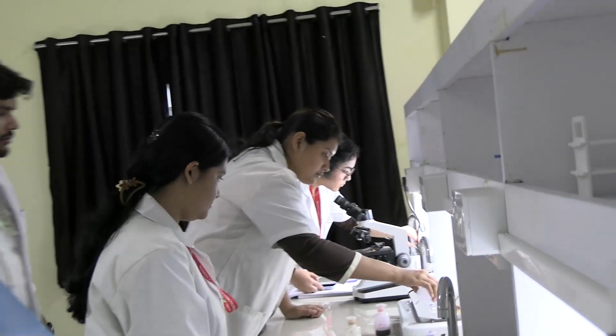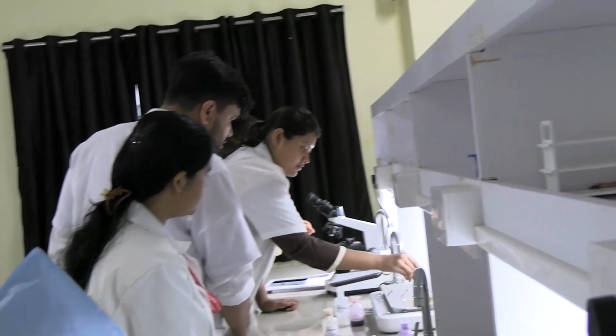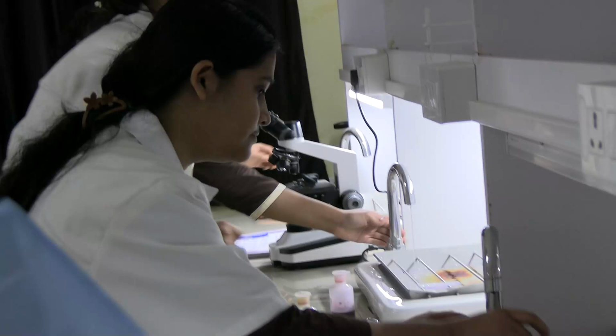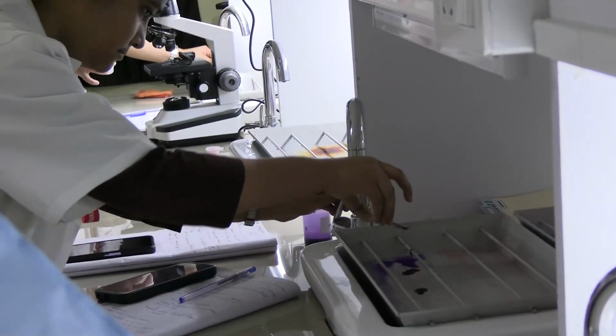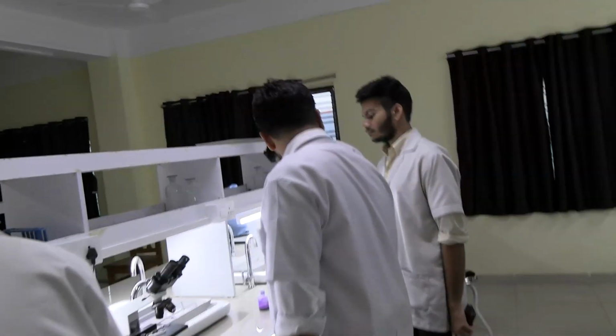You wait, okay? Wait. I'm going to come. Wash it directly now. Go. Wash it. Very good. I think that's enough. Now there is a counterstaining. Counterstaining using safranin for 30 seconds. Okay. Start. Is your time over?